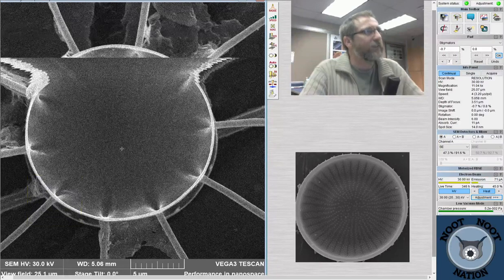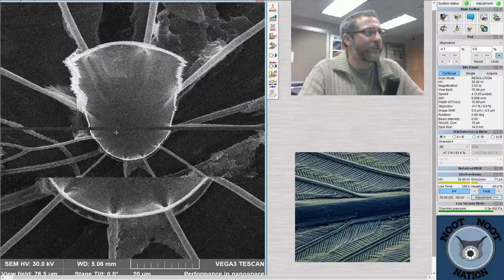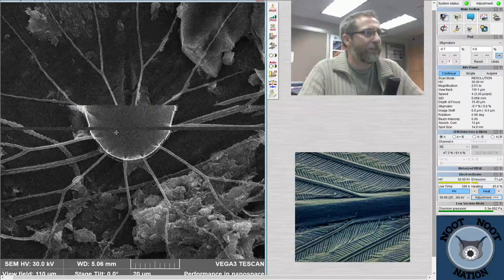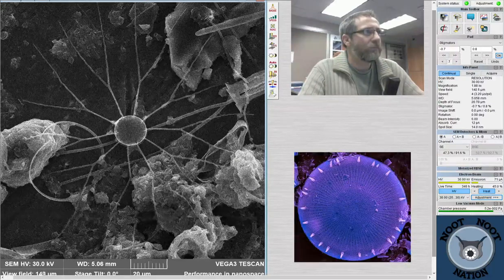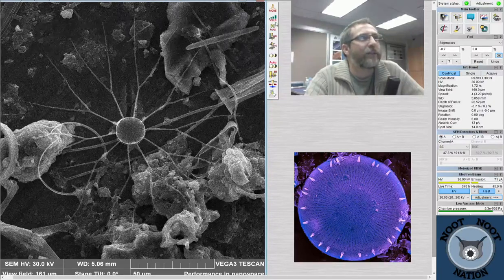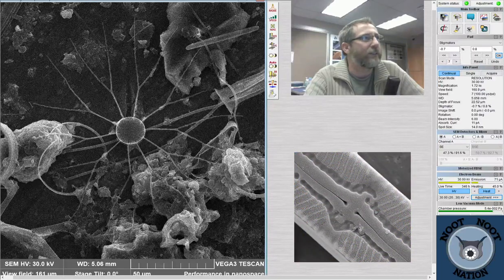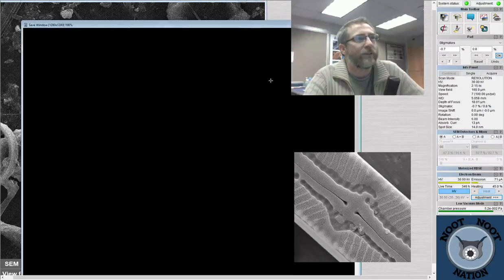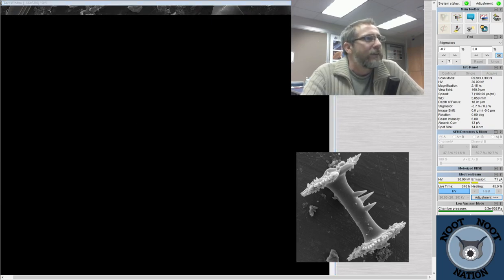I'll just put that like that. Got ourselves a happy little diatom. Looks like a sun mixed together with a tree. Would have been nice if it was not laying on top of a bunch of junk, but junk is what we got, so junk is what we're going to take. And we're going to get a nice high-res image of this, and then I can come back to chat and see what you guys are talking about, and call out some of these as well.